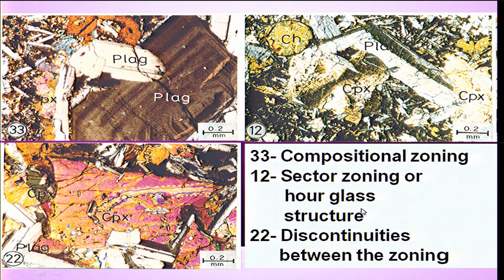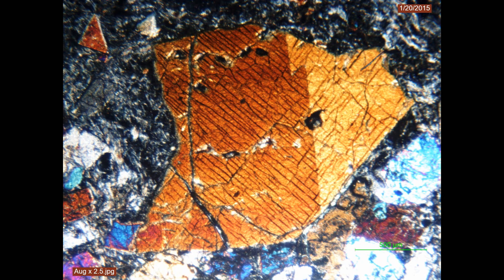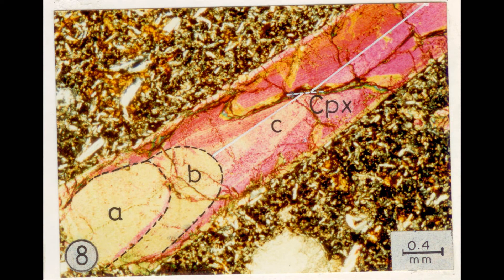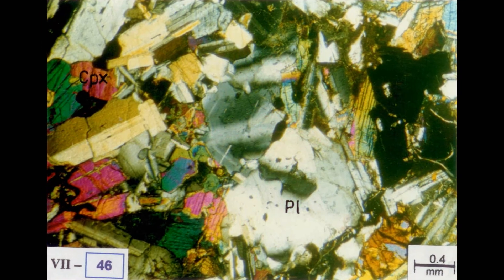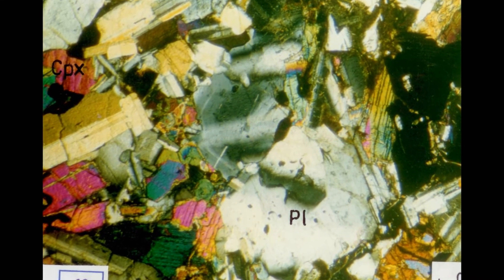Discontinuities in zoned structures are also present. This is a large plagioclase crystal — more calcic in nature at the core. When analyzed with a microprobe, the periphery is less calcic and more sodic. There are discontinuities and sectors in the zoned structure. When you rotate the microscope stage, half of the sector becomes dark while the other sector becomes illuminated, and vice versa. This kind of zoning is known as sectoral zoning, better known as hourglass structure.